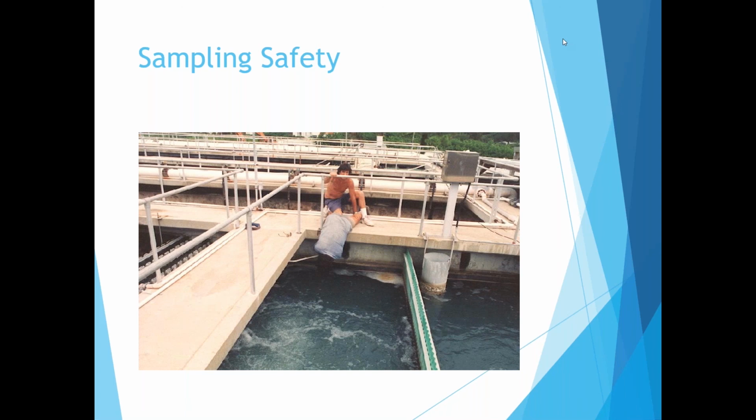If you're looking at the video, we were opening and closing that door. And so you see how fast the temperature rose. When we started at the day, I think the first time we opened the door, it was at 3 degrees C. So it was pretty cold. But by the time we had been in and out of it, I think it got up to almost 9 degrees.